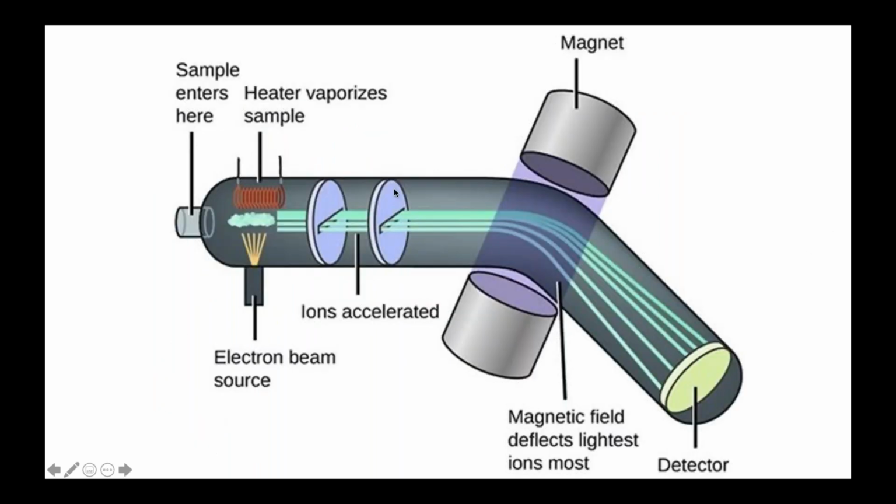And this is just a quick schematic to show you what this detector may look like. So you have an electron beam, which will ionize your peptides, which came in here. These peptides then are going to go through this accelerator, and they're essentially really big magnets, and because of their different composition, they're going to have different charges.